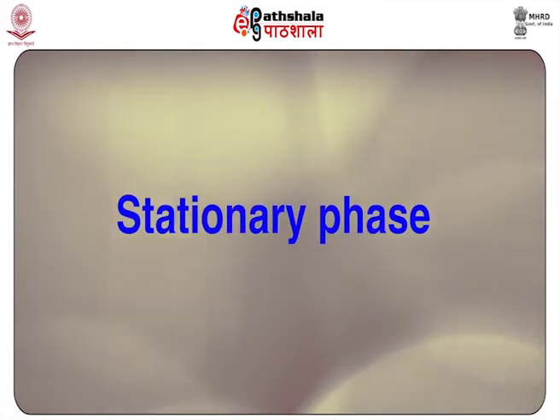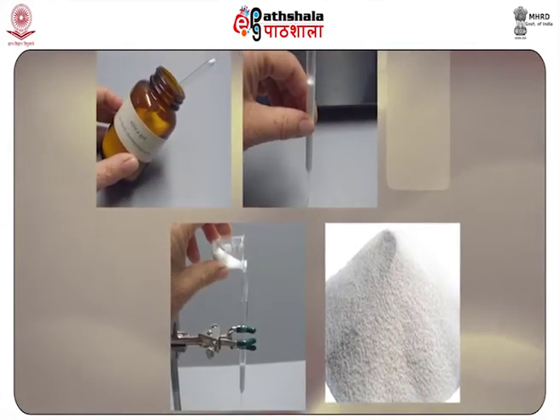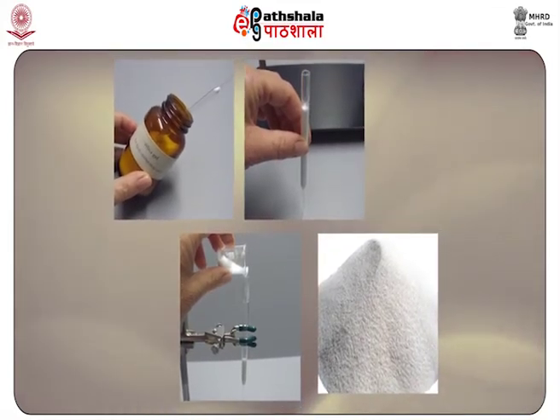Next, moving on to stationary phase. In column chromatography, the stationary phase is a solid. Silica is the most common, followed by alumina. Generally, these stationary phases are microporous and finely ground gels or powders.